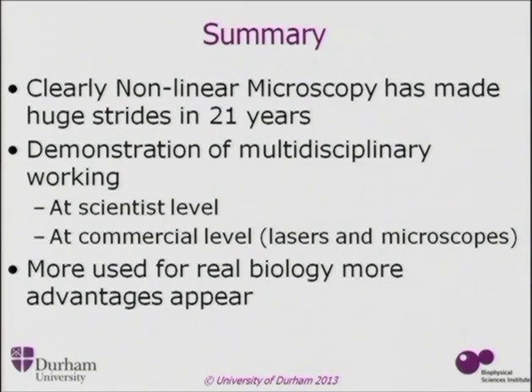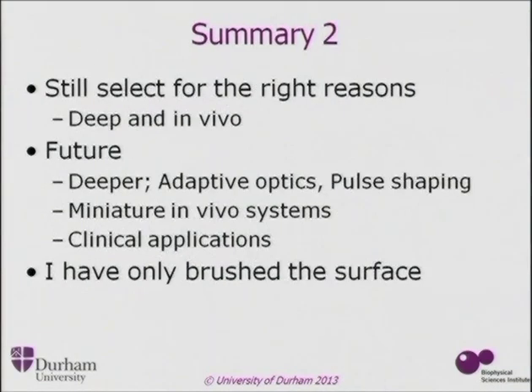And it's used more and more for real biology. When you're thinking about methods, select the right tool for the right job. Use these complicated systems when you want to go deep and in vivo. And when you want to go deeper, you need to use adaptive optics. Not a subject here. You may need to even change the time shape of your pulse. Miniature options are available. And I've only sort of brushed the surface.